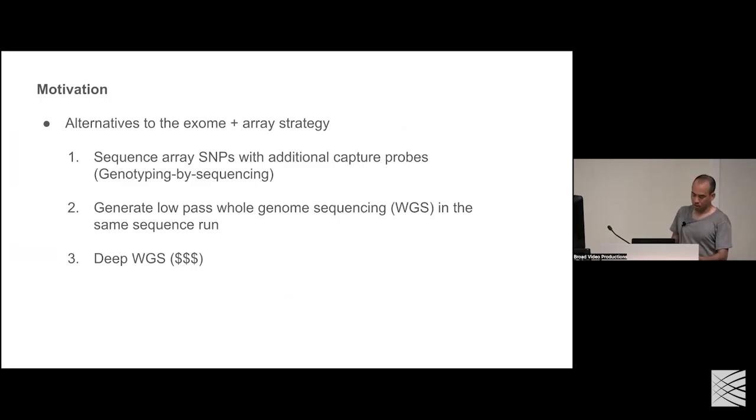And so the alternative to this sort of approach is to actually just add SNPs directly into your exome array. So you could think, you have your exome capture, it captures exons. Why not just create more probes to capture these variants? You might get stuck in the same problem if you don't pick your probes and your SNPs right. But you could say, there might be a cheaper alternative to these two products, and you can pull out more non-coding SNPs by adding more probes to your exome.